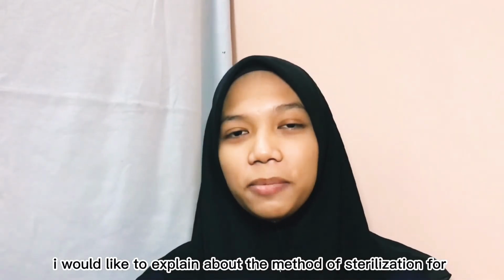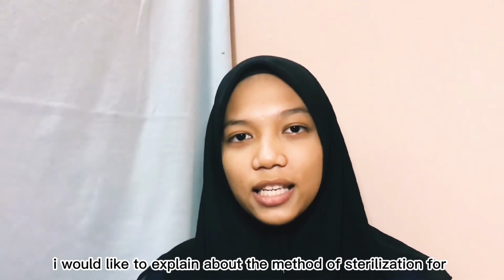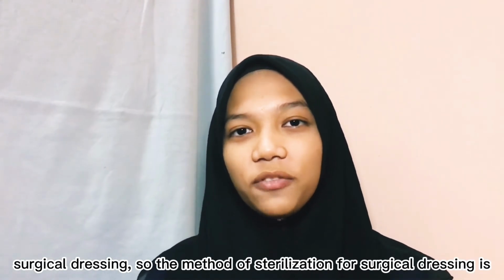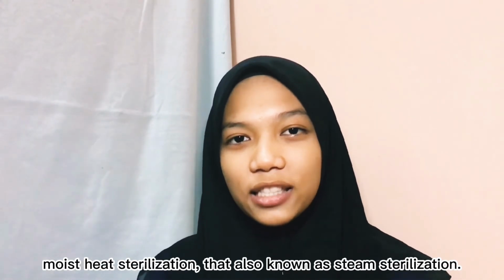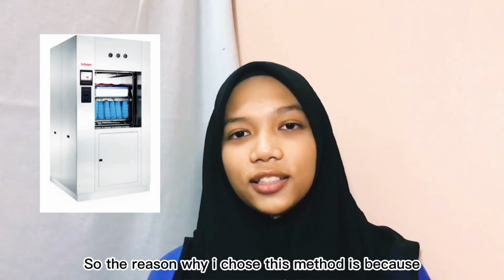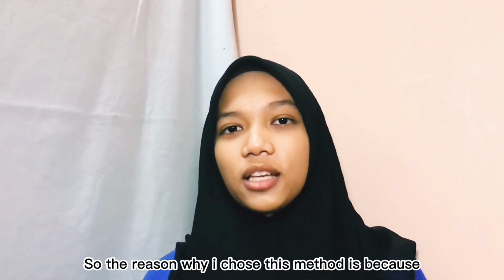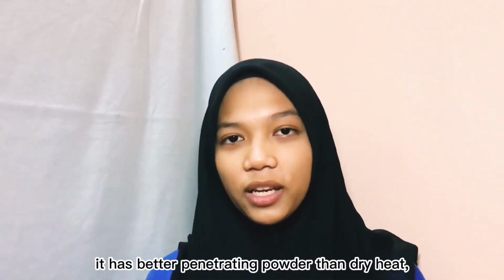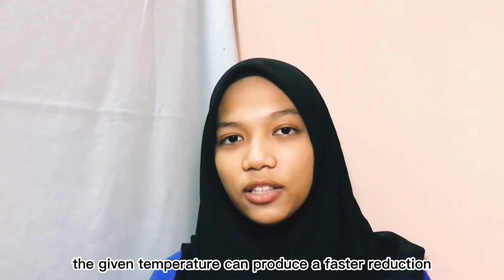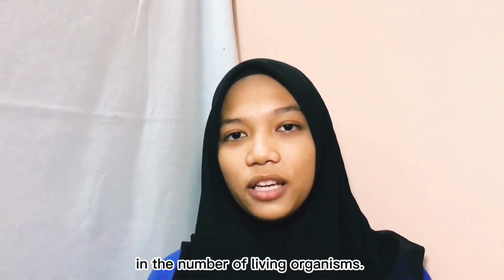I would like to explain about the method of sterilization for surgical dressing. So the method of sterilization for surgical dressing is moist heat sterilization, which is also known as steam sterilization. The reason why I chose this method is because it has better penetrating power than dry heat. The given temperature can produce a faster reduction in the number of living organisms.